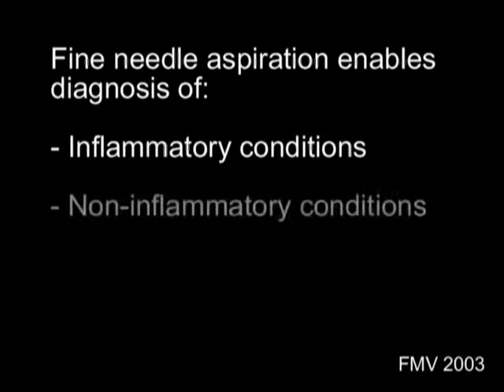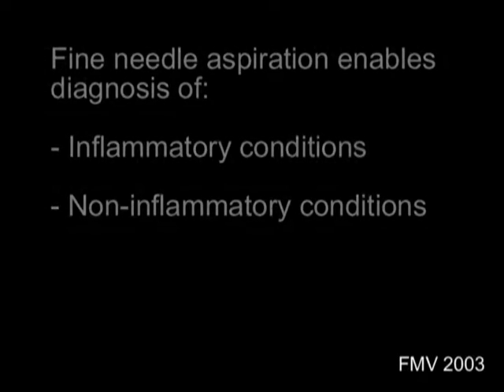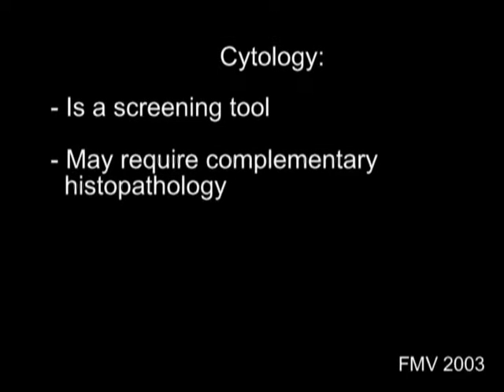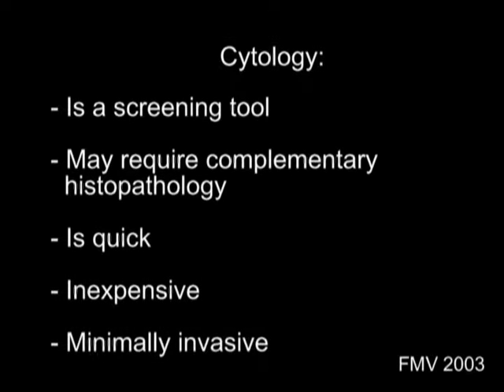fine needle aspiration of a mass or of a superficial organ such as a lymph node enables the diagnosis of both inflammatory and non-inflammatory conditions. One should keep in mind that cytology is a screening tool used in the diagnostic process, such that in some cases complementary histopathologic examination may be required to confirm a diagnosis or to further characterize a lesion. Cytologic sampling is a quick, simple, relatively inexpensive, and minimally invasive technique.